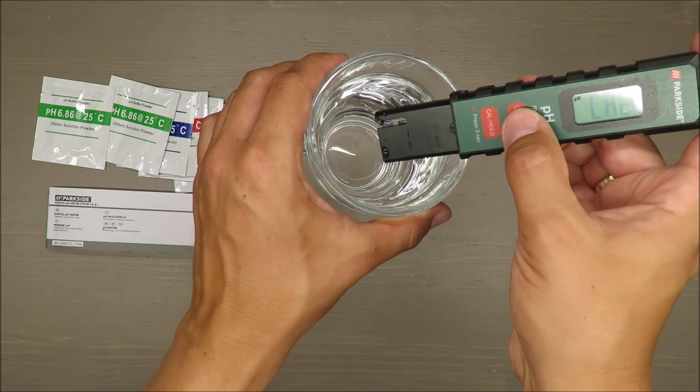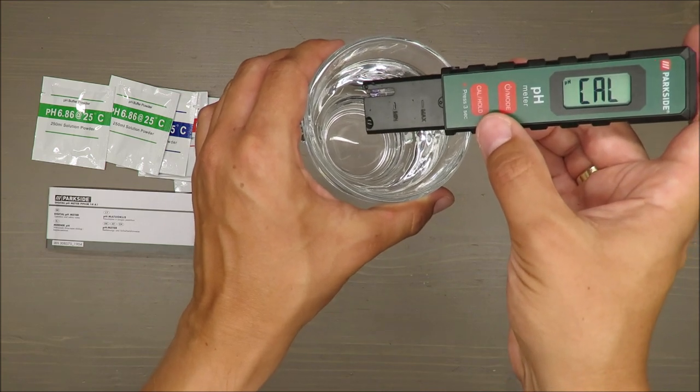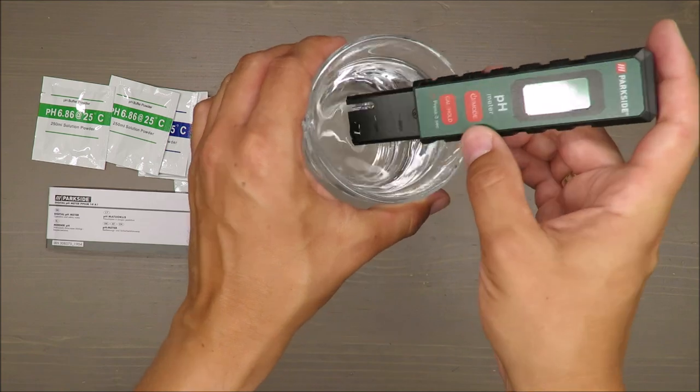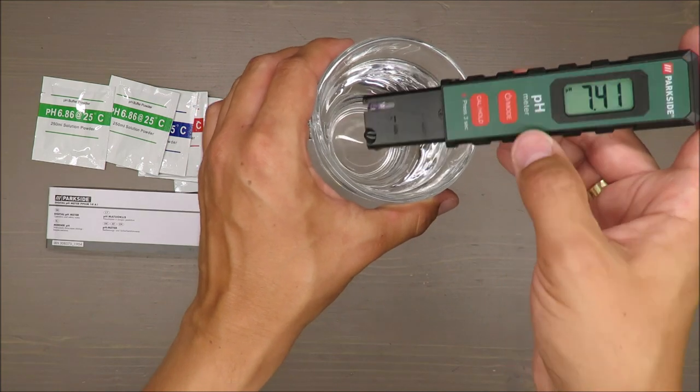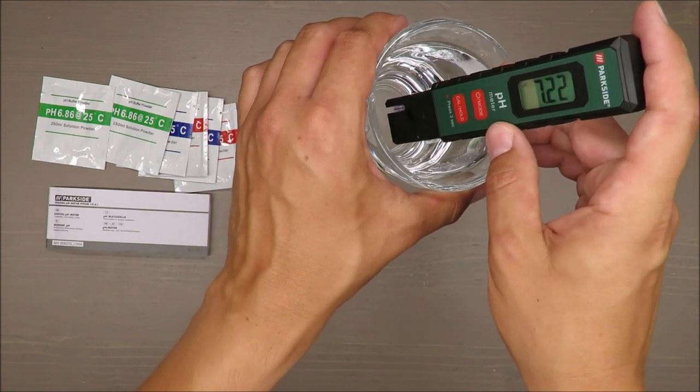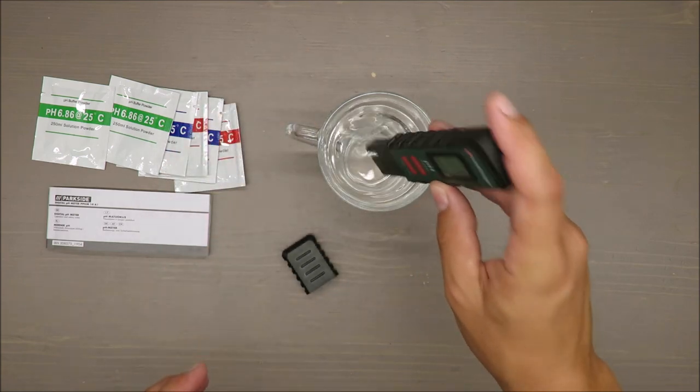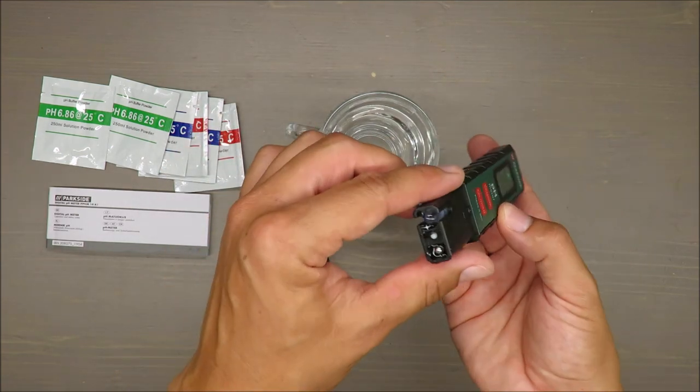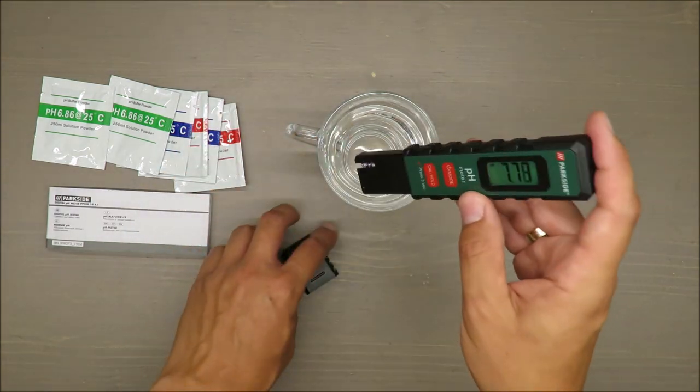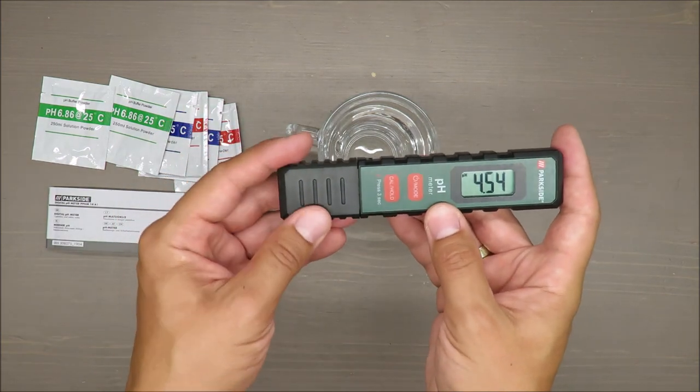Let me turn it on. Calibration, I don't want to wait. Okay, now it's at least consistent. But again, I'm really curious about how you can use it in your daily life.